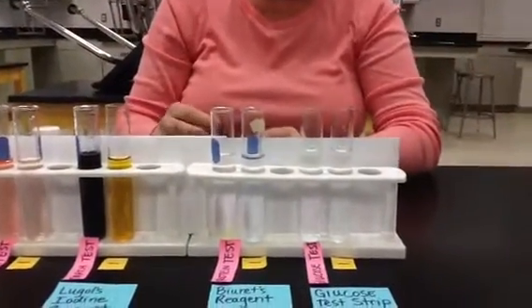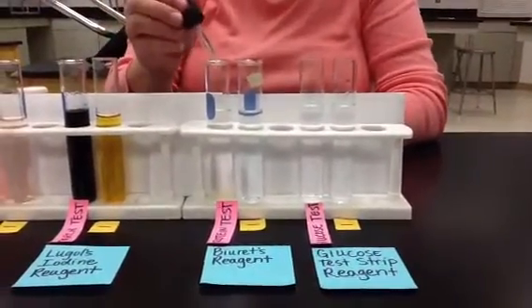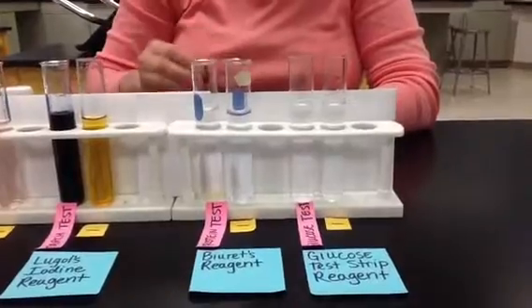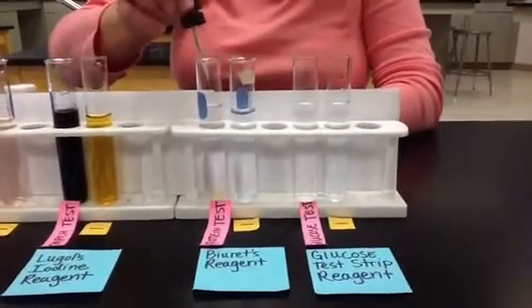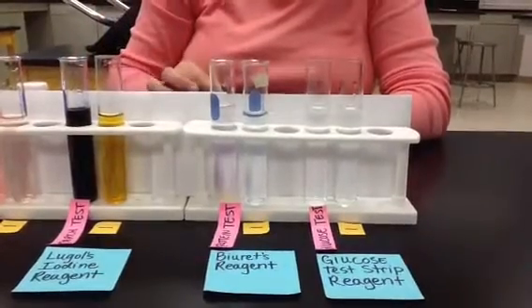Now we're going to test for our positive test. So if there's protein in this, we should see a color change. And again, you have to add quite a bit. So we're going to do that and mix it up.